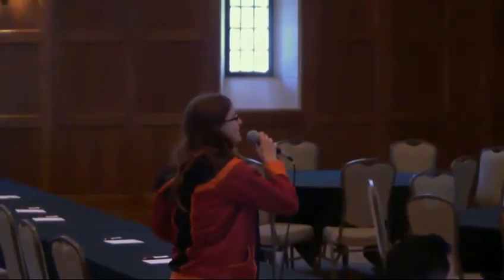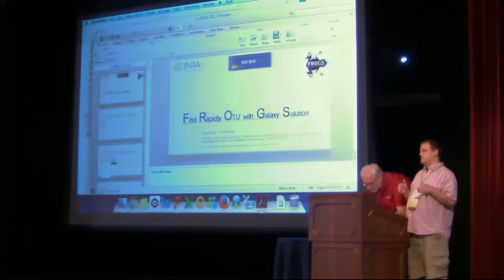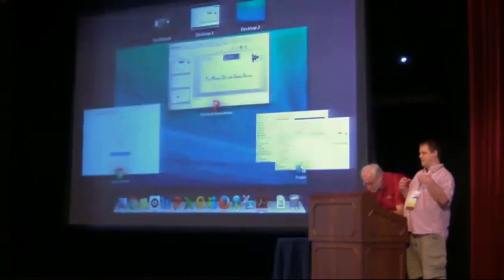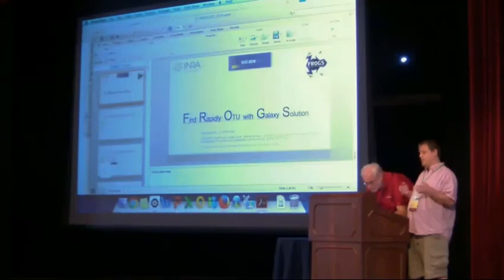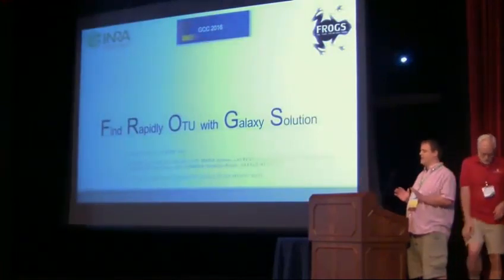I always like to ask you the hard questions, Dan. With the biome annotation, is that a fairly manual process per file? What do you mean? So if you're going to add stuff like the metadata, where you got the sample from, what it was sequenced on, et cetera. Right, so if you have a tabular file that lists your samples and then the metadata values along with it, you can just use the add or create biome tool, and that'll just fix that into this JSON format for you. Oh, that's nice. So that works fine. A lot of times generating those tabular files is the hardest part.